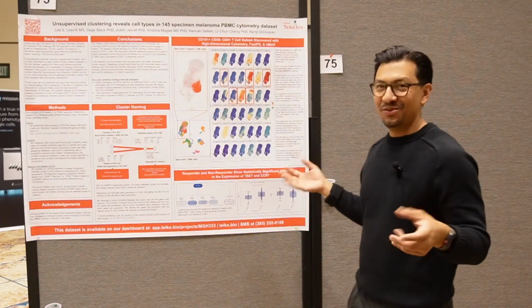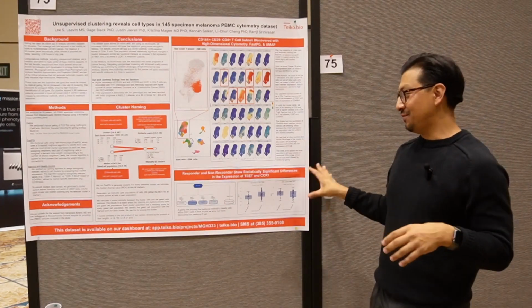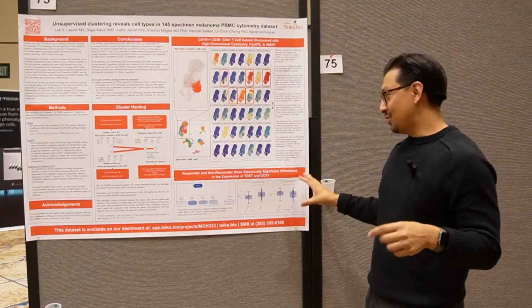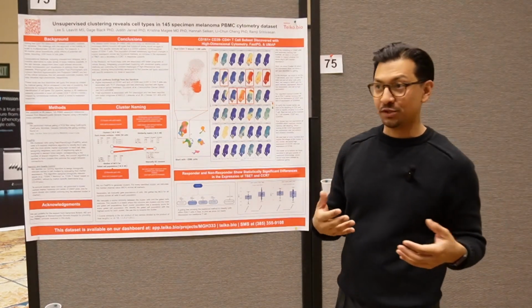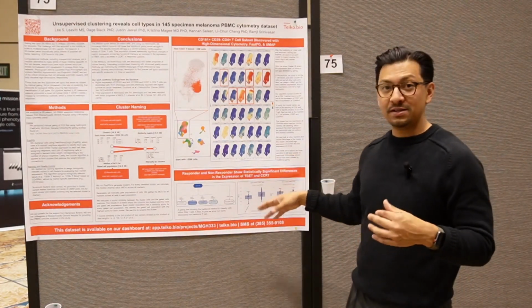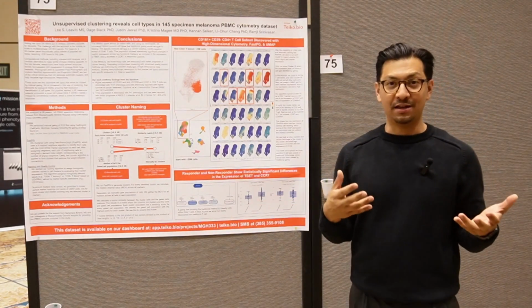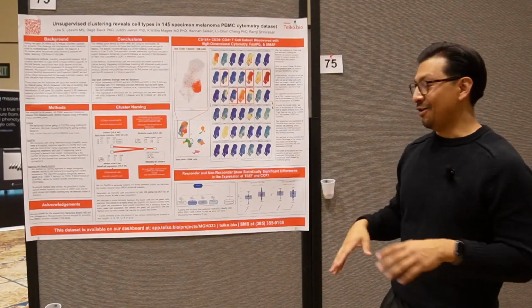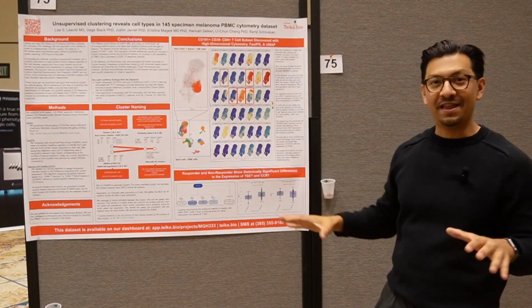Conversely, we saw the opposite effect with CCR7, a decrease in the responders in comparison to the non-responders. So what does that mean? There actually still is a lot of work to be done by our team and the team at MGH to figure out what this all means in terms of the relevance to melanoma anti-PD-1 response. There has been some literature that has suggested that the prevalence of this is correlated with good prognosis in certain cancer types and certain therapies. However, a little bit more work needs to be done in order to fully flesh out what that all means.